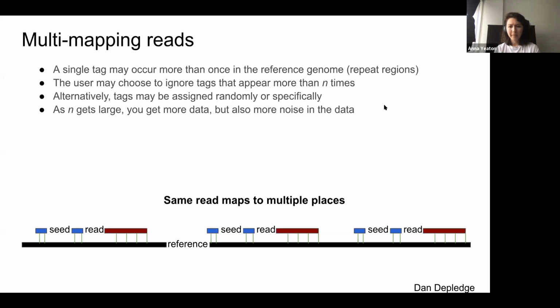And Nicholas says, what does the seed portion refer to? The seed portion refers to the fact that a lot of the times programs just use a small portion of the mRNA to search around to see where it fits, and then it'll look at the rest of the portion just for computational efficiency.